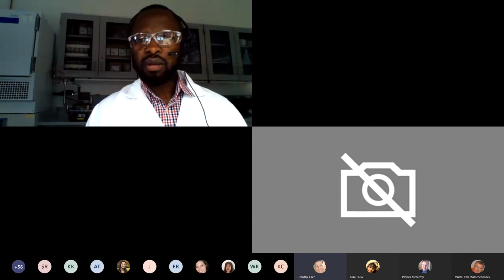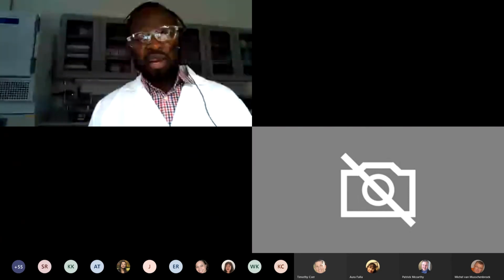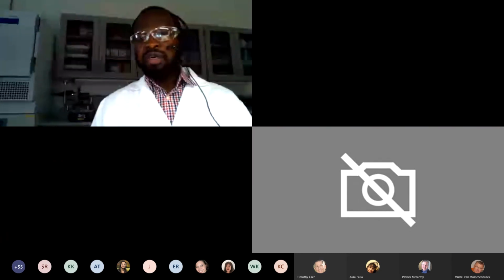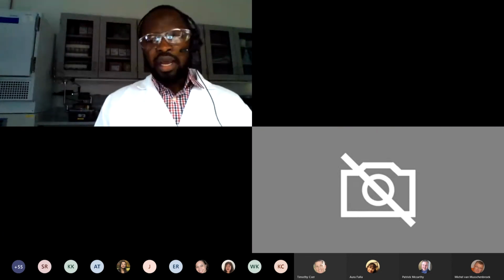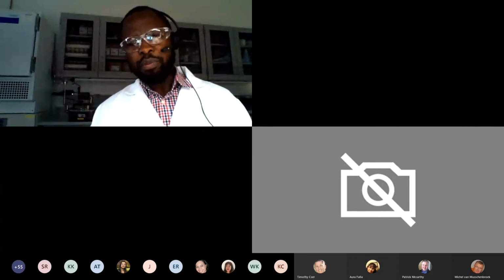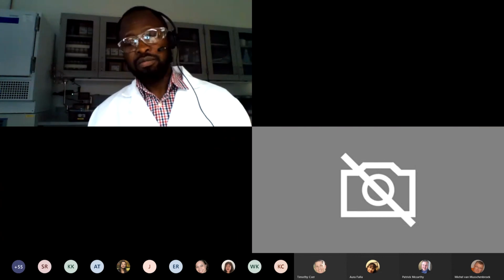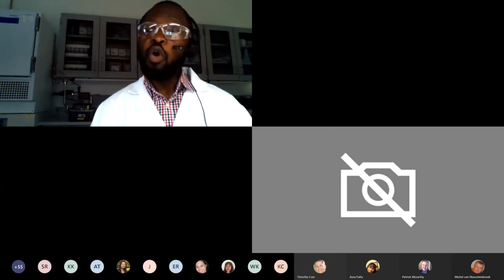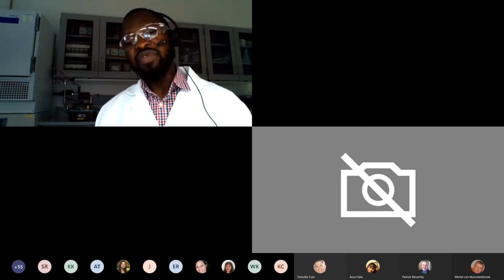Hey, Lamine, how often do you find people are not pre-wetting their membranes? A lot, actually. To be honest, I have seen it. I mean, it's pretty common. I talk about it. Some people get surprised and say, "Oh, really?" To be honest, even myself, before I joined Millipore, I had never done pre-wetting before. It is when I joined Millipore that I learned about pre-wetting, but before, I had never practiced it. But it does really make a difference.